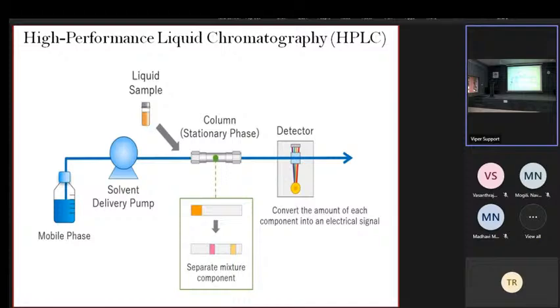For example, we are injecting a sample that contains 4 components, A, B, C and D. All of them will interact with the adsorbent here. A elutes first, then C elutes after 1 minute, B elutes after 5 minutes, and finally compound D elutes at 10 minutes. So for resolution, we get one peak, then a second peak, a third peak, and a fourth. All 4 components are eluting from the column and the 4 peaks are separated. Okay.